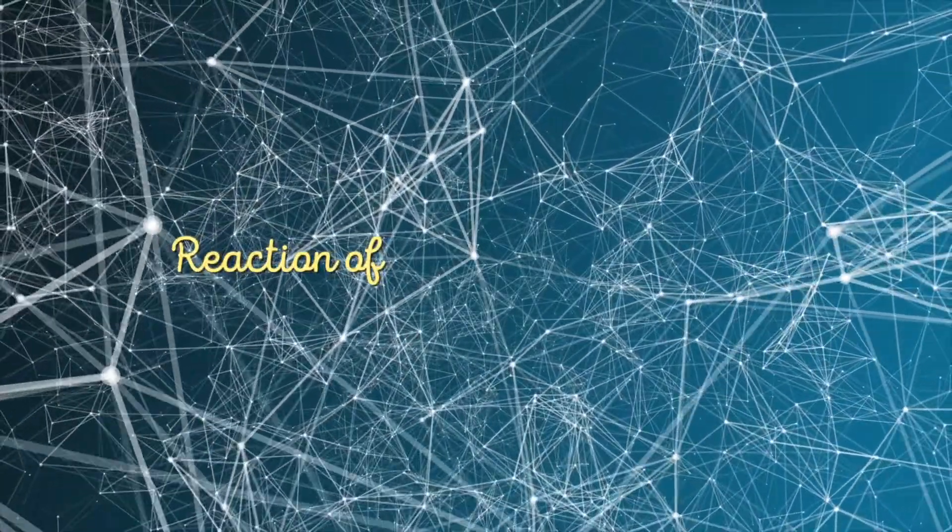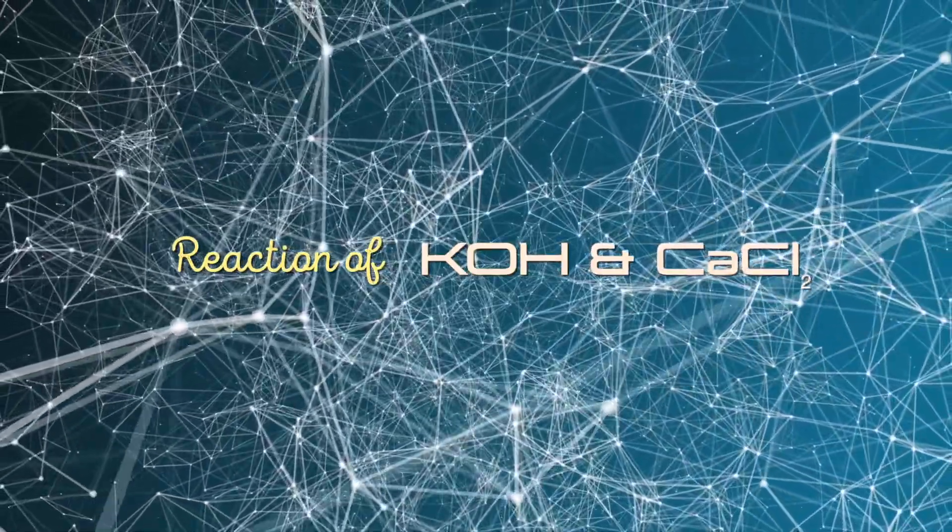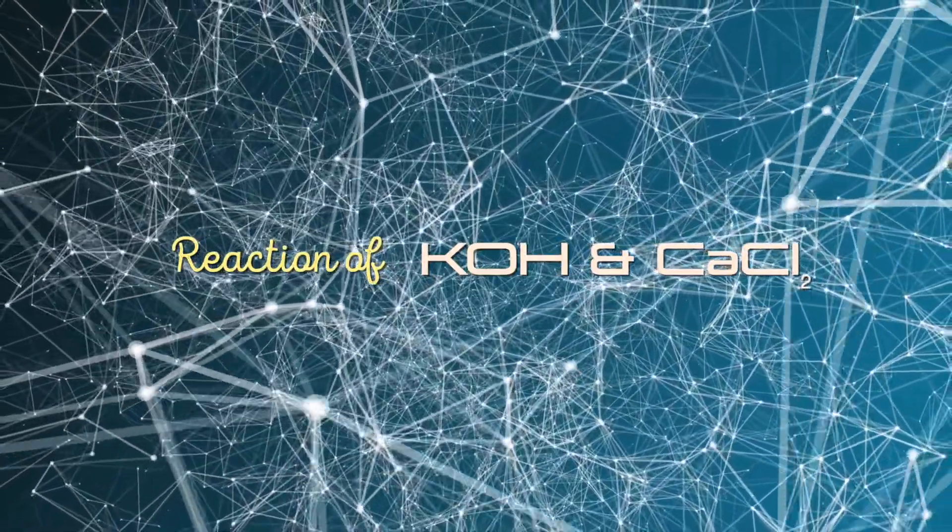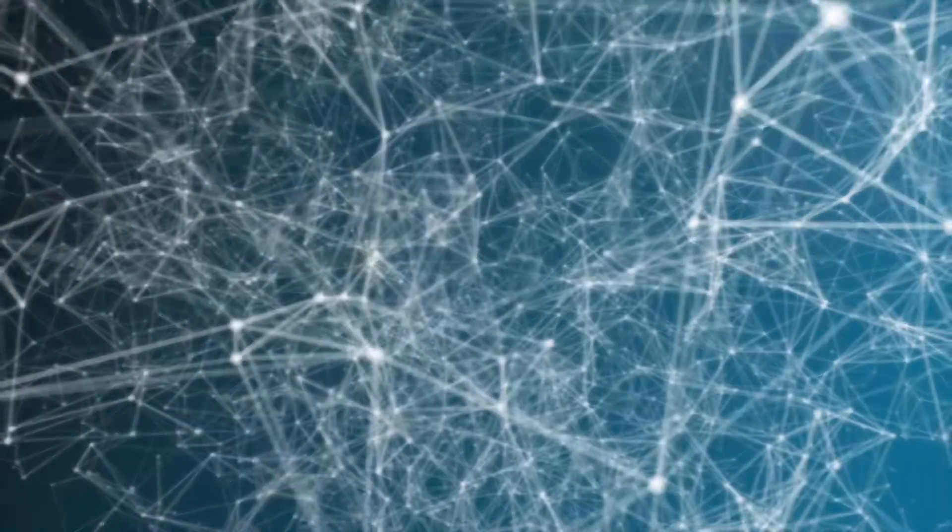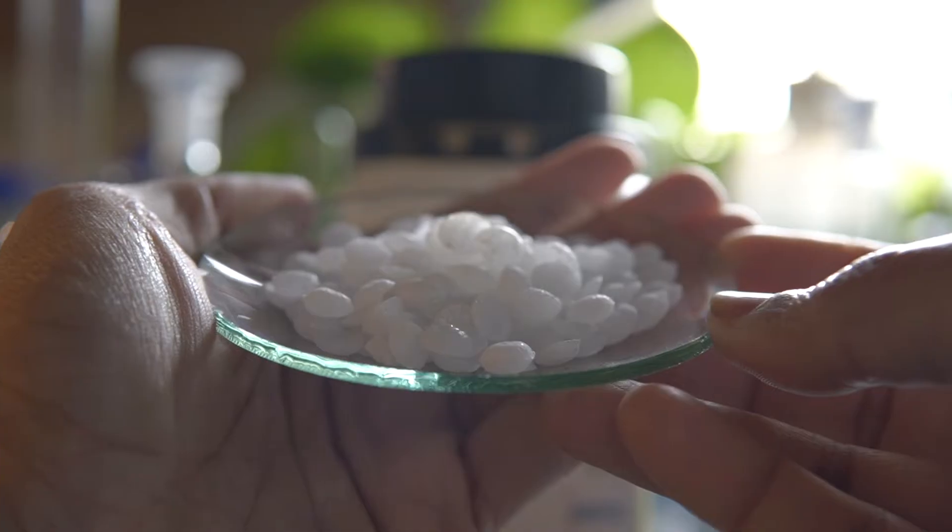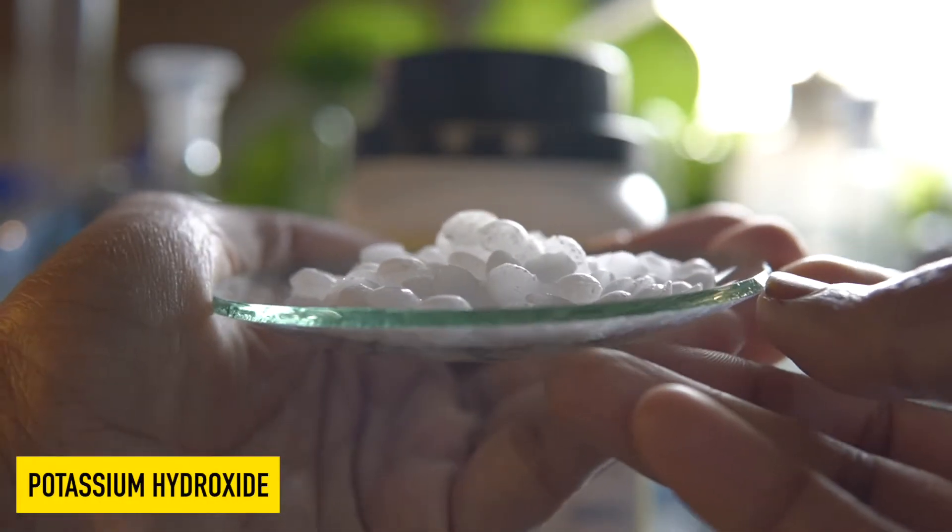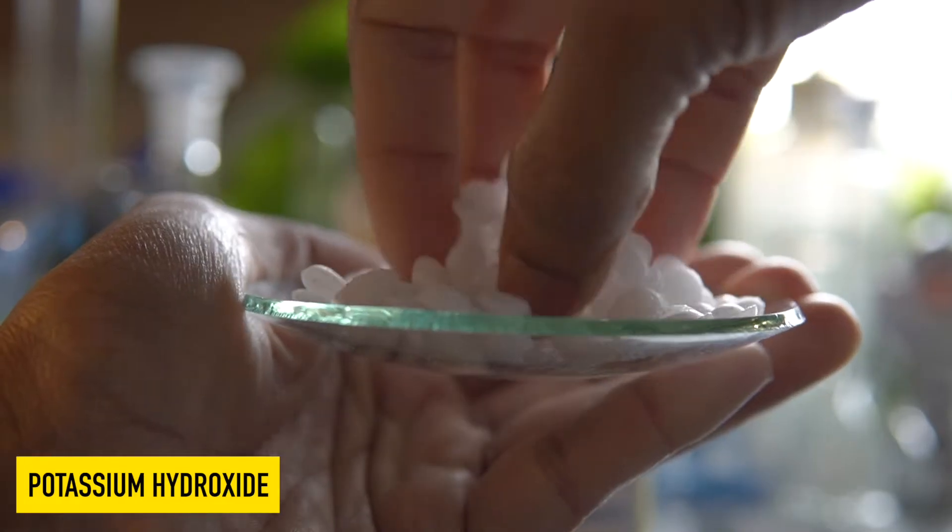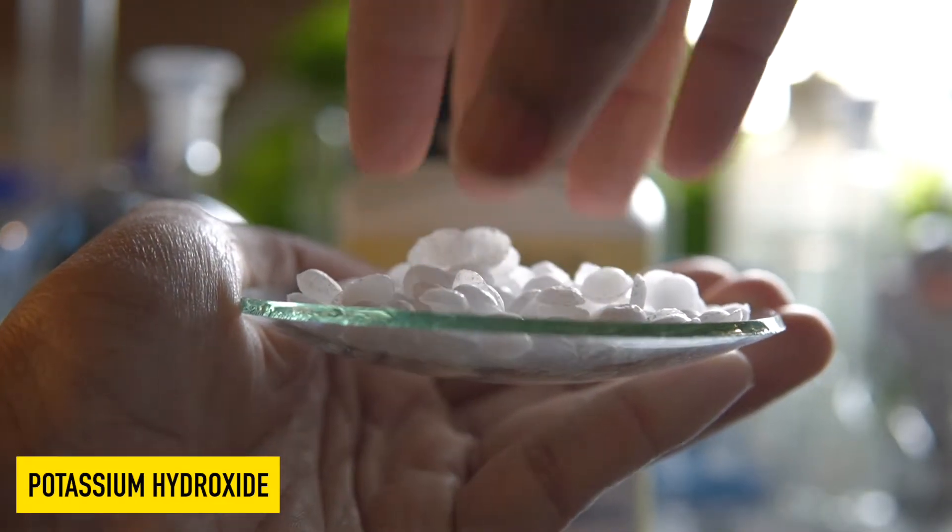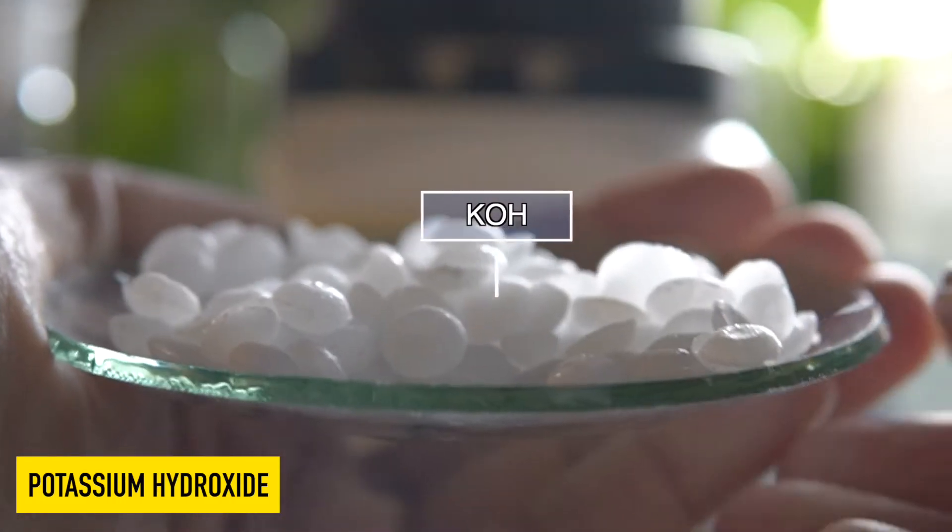Today we're going to observe the chemical reaction between caustic potash or potassium hydroxide and calcium chloride. These are KOH pellets - they are hygroscopic in nature and can easily dissolve in water to make KOH solution.